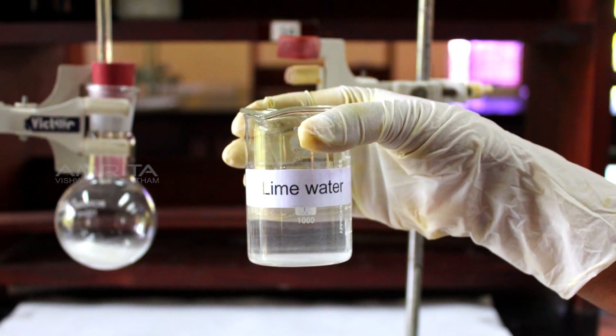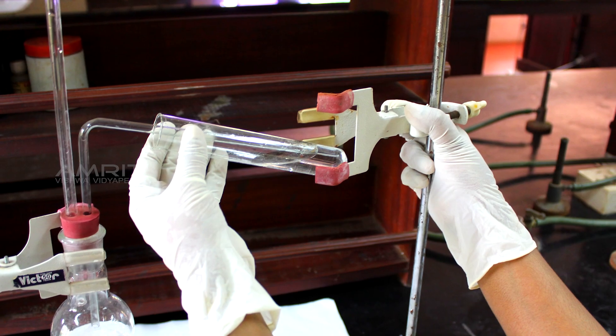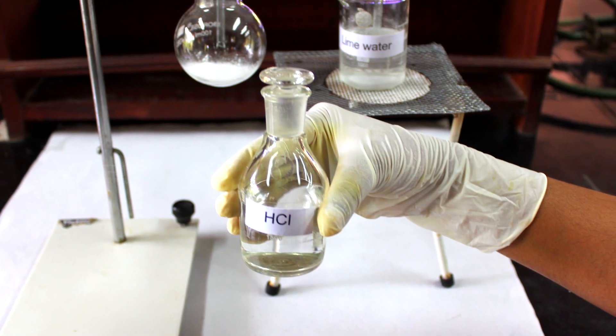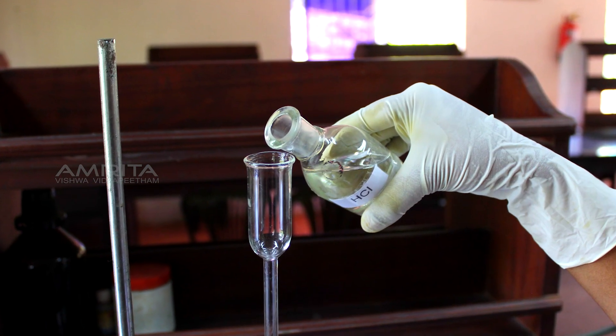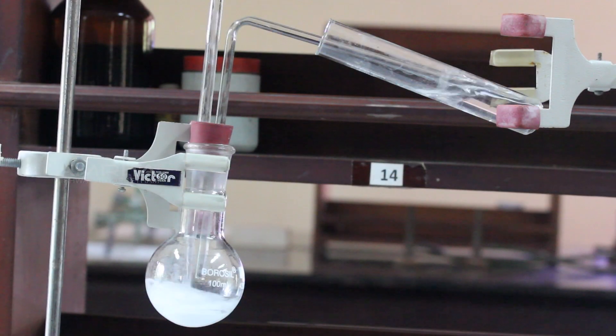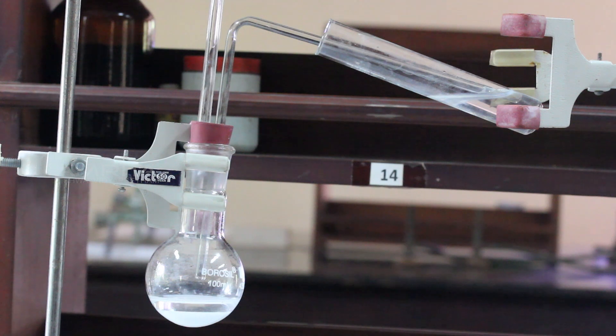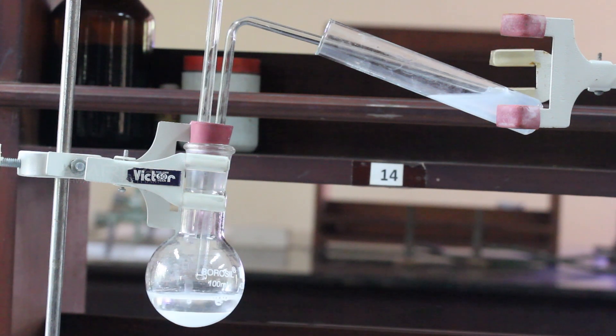Now, pour a small quantity of lime water into the boiling tube and clamp it with another stand. Then add HCl to the sodium carbonate solution in the flask using the thistle funnel. You can see that a gas evolves and passes through the lime water and turns it milky. Here, due to the action of HCl on sodium carbonate, carbon dioxide is formed which turns lime water milky.